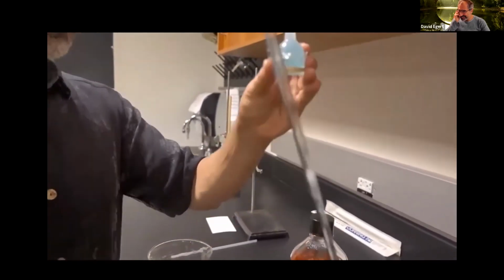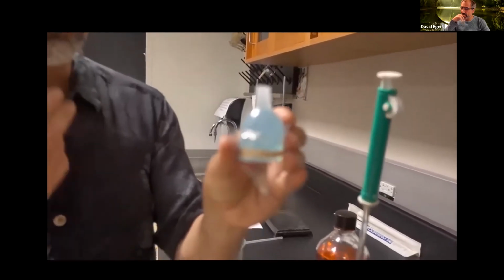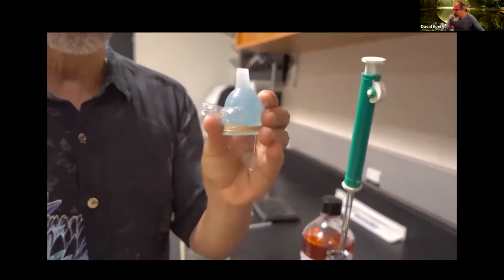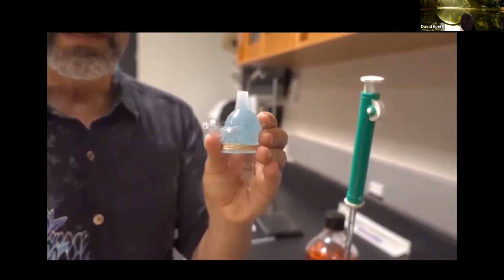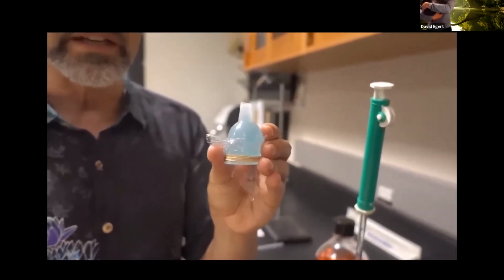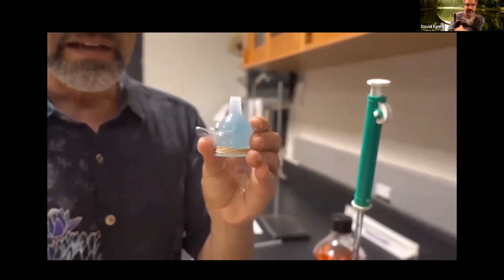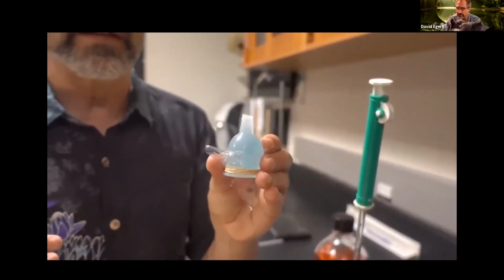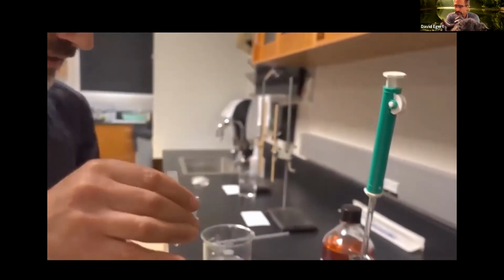All right, so this is filled up, and I should mention that color is purely just for visibility. It doesn't affect osmolarity or the concentrations. It's purely just for color. The red and the blue, don't think of them as players in what the osmotic rate is going to be. It's just so you can see things.